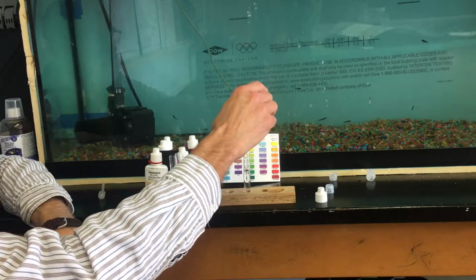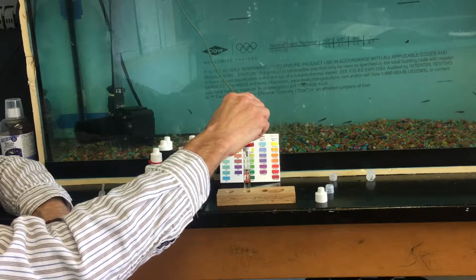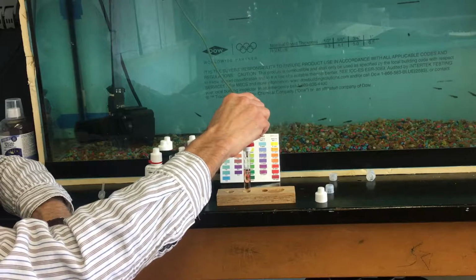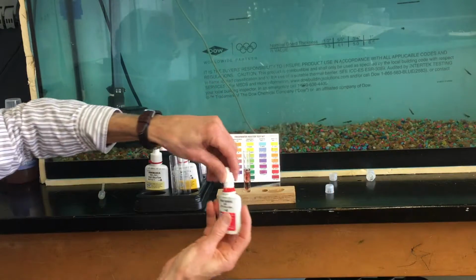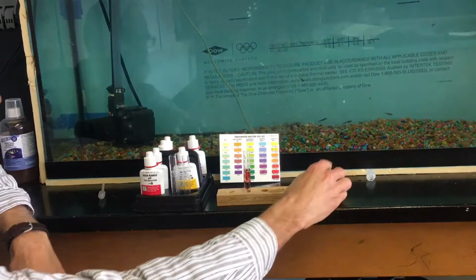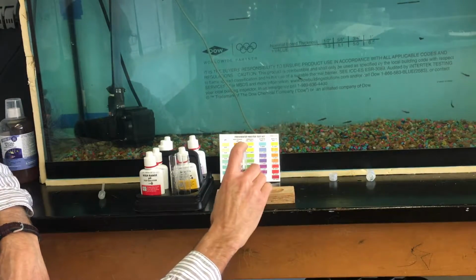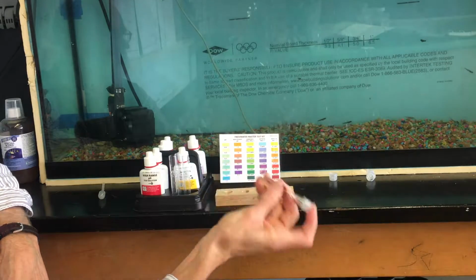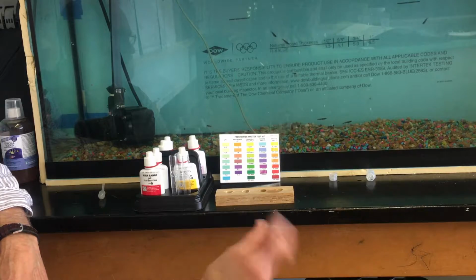And this one is a 5-drop, and 1, 2, 3, 4, 5. Lift it straight out, put the cap back on, close it up tight, put it back in the container, put a plastic cap on top of my test tube, put my finger over the top of the cap, and I agitate that gently for 5 seconds.